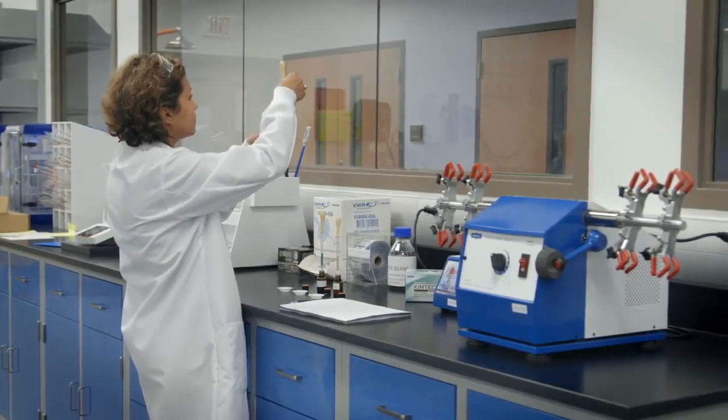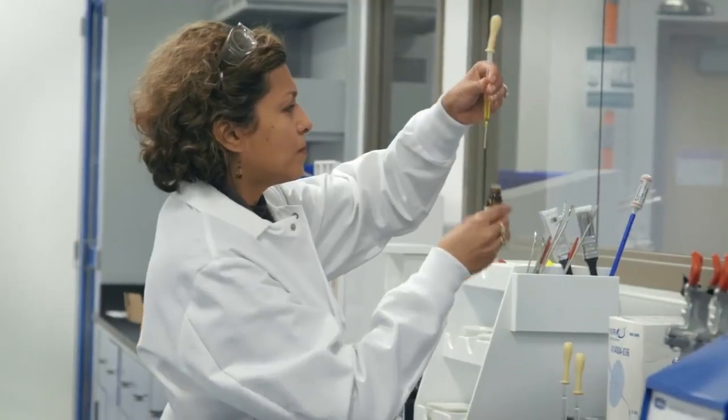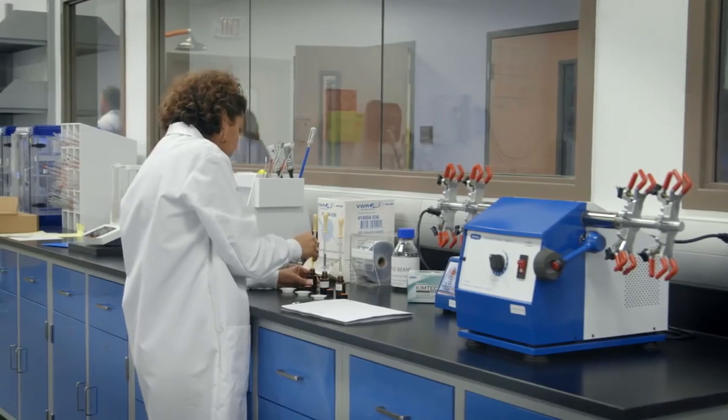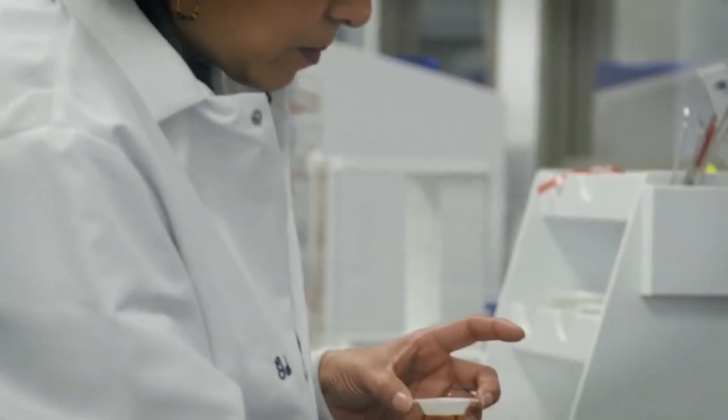After each oil has been identified by GCMS and further identified by FTIR, we actually test the physical parameters of each oil. The physical testing is a compilation of quite a few different tests.